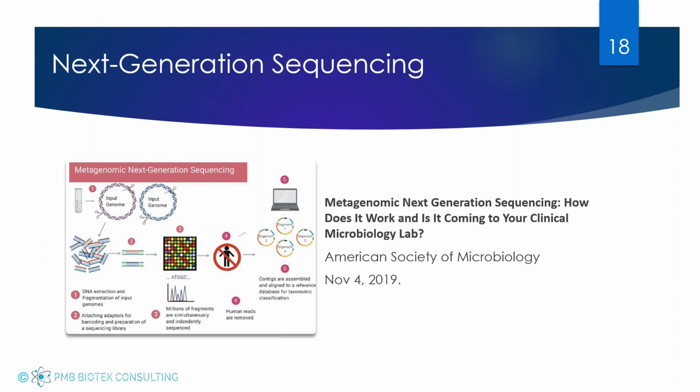But ultimately, the information that you can learn, whether it's the biomarkers present in a sample, whether it could be a persistent organism to your facility or coming from an external source, whether there are antibiotic resistance markers in there or other virulence markers. As we start to learn more about Aspergillus, are we going to find out that there are certain markers that need to be present to really make people sick? So maybe the regulations change and we don't need to test for Aspergillus in general, but we test for certain biomarkers that could produce mycotoxins or make immunocompromised people ill. Ultimately, I think that's where we could see NGS taking a role.